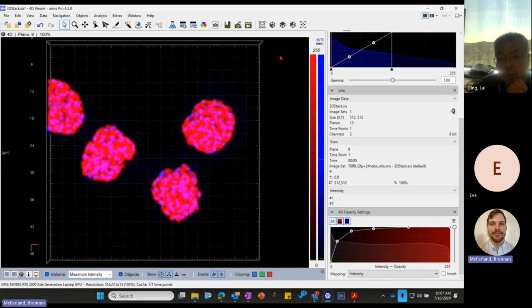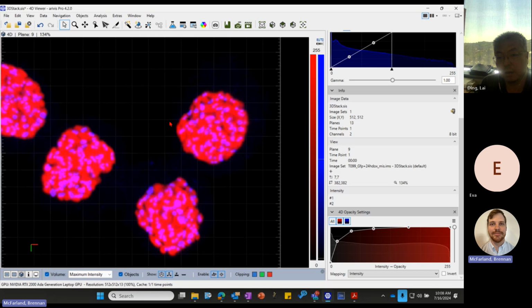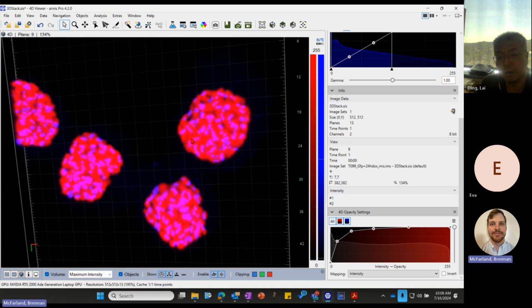One thing that a lot of customers will ask about is what's called compartmentalization, so doing cell by cell analyses and measurements. What that means is, let's say I'm curious about the amount of puncta that's inside this object. We would create an association between a segmented object here and the segmented blue spots.